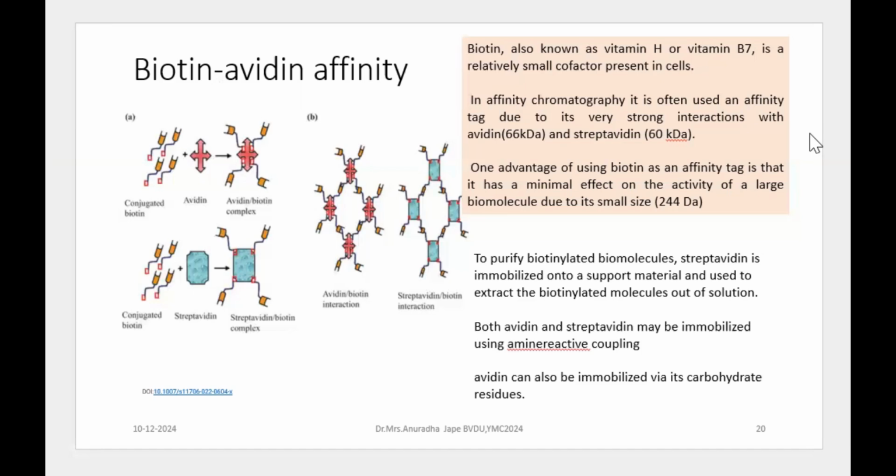Now, when you talk about attachment of the ligand to the matrix, you should take care that it doesn't prevent binding of the ligand. When a ligand binds onto the support, it will bind through the interactive forces. And while getting anchored onto the support matrix, the ligand should not compromise on functional sites which would help its binding with the analyte of interest, right?